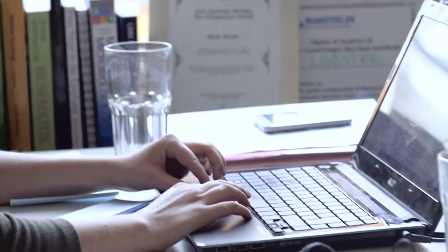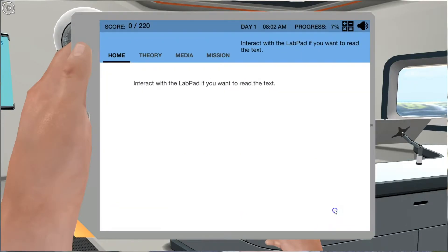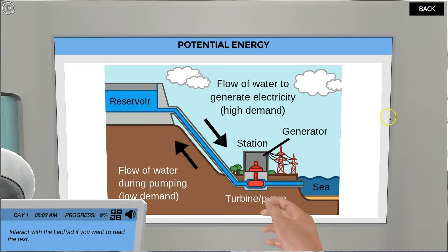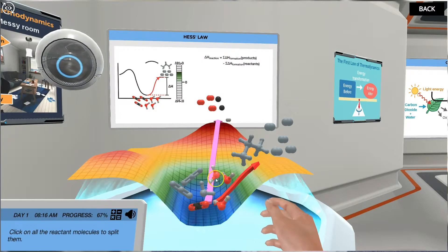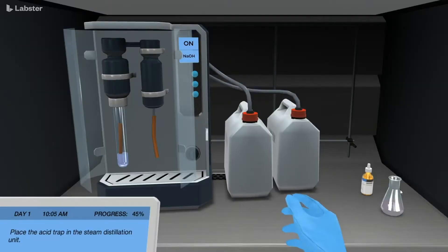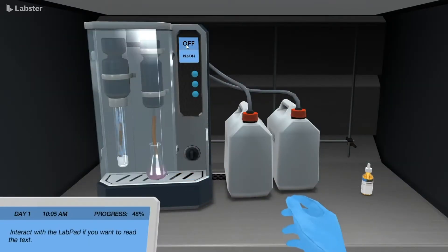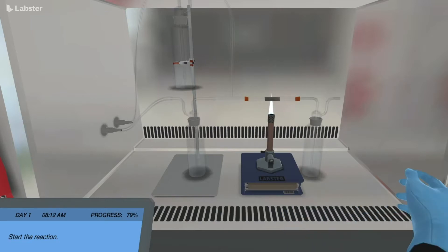When you can do it in a virtual lab there is no time limit. You can try out an experimental procedure in a simulation at your own pace while you get instructions as you go, so that you actually understand the experiment before you do it in a real lab — that can be extremely beneficial. We can allow students to not only follow the safety protocol correctly, but also give them the room to experiment and explore through failure in a safe environment.